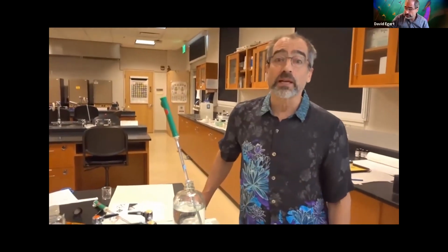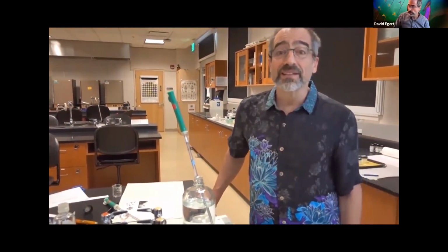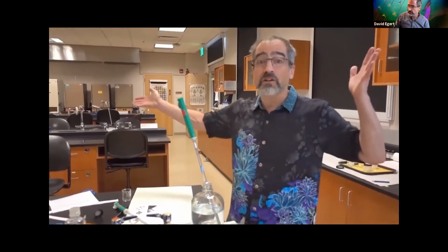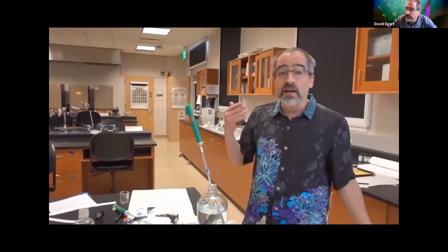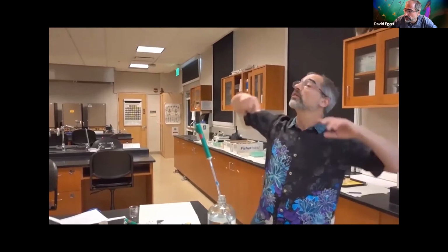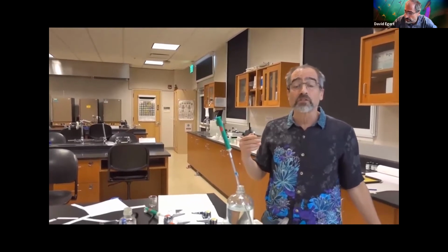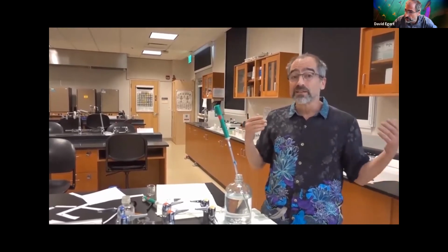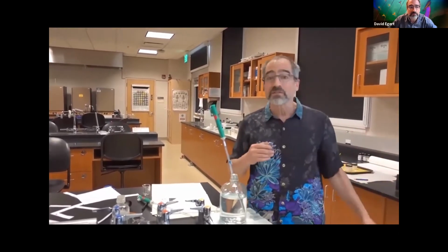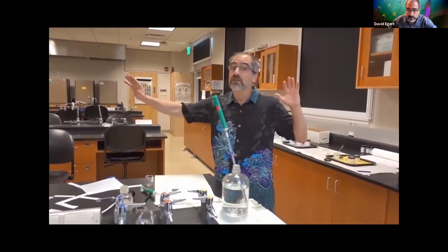And then the next part is going to be testing for electrical continuity, basically whether or not it can conduct electricity. And conducting electricity is basically, an electric current is moving charge. So for there to be an electric current, there has to be charge moving. In the wires, in the lighting in the room, it's electrons moving through the wires. In most biological systems, when you have electricity, the electric current is ions that are moving. So having independent ions floating around in a solution typically is going to allow an electric current to flow.